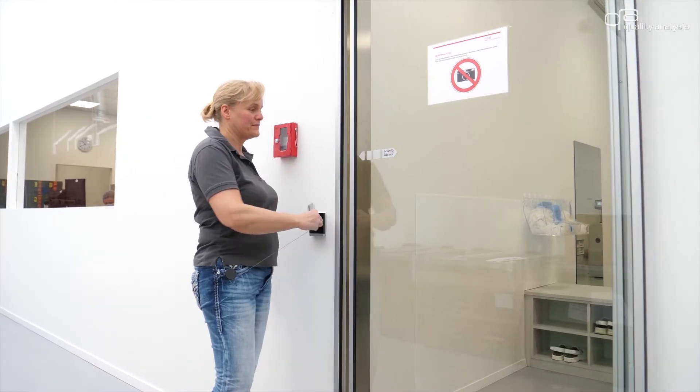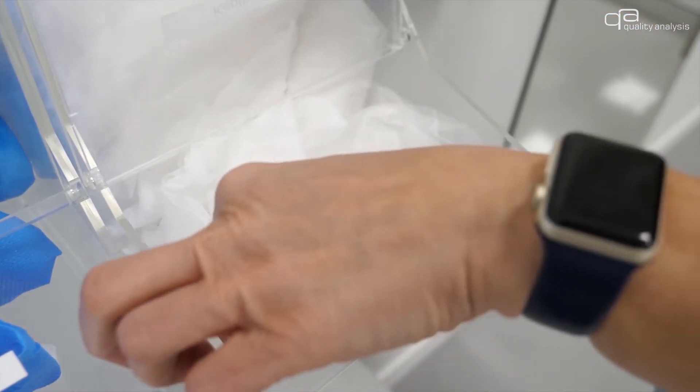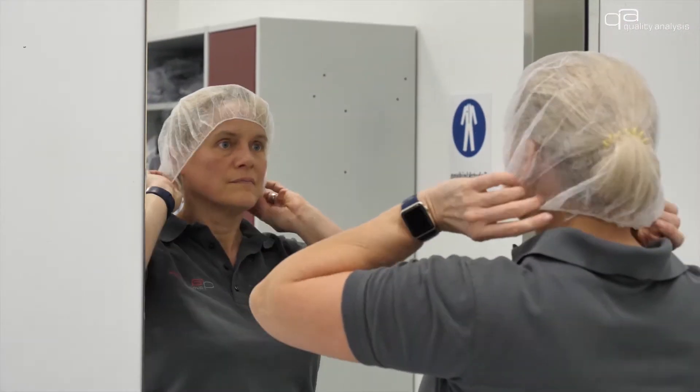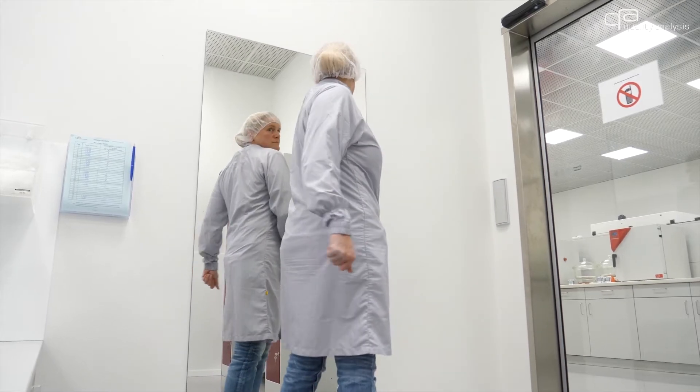Our analysis in the field of technical cleanliness take place in the clean room class 5 and 8. Only authorized and trained personnel are permitted access to these rooms.